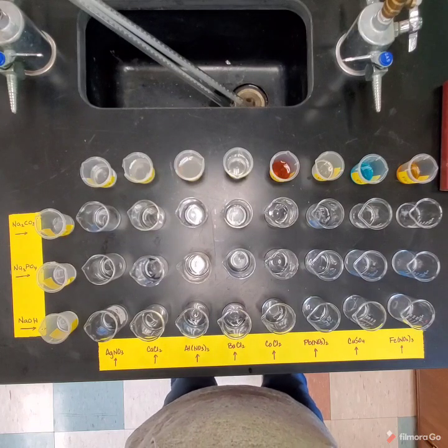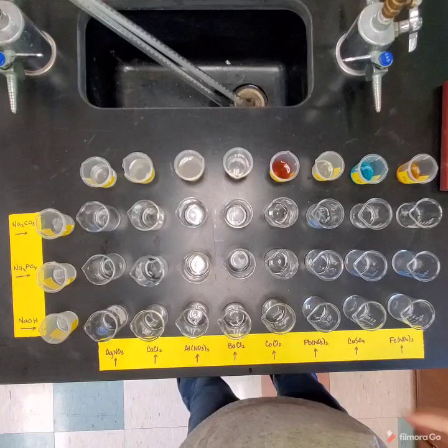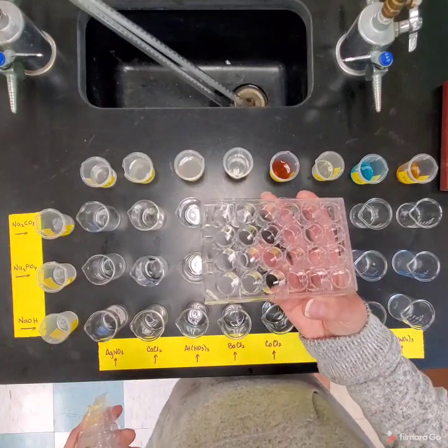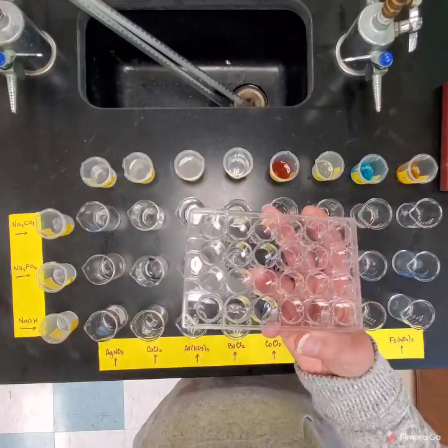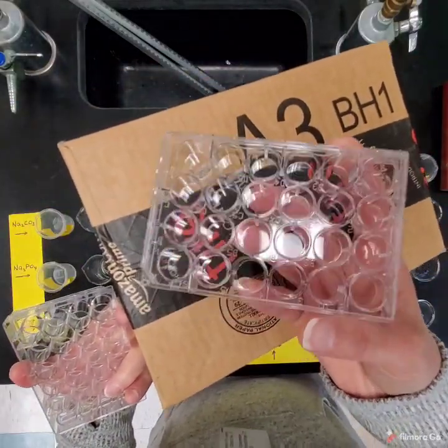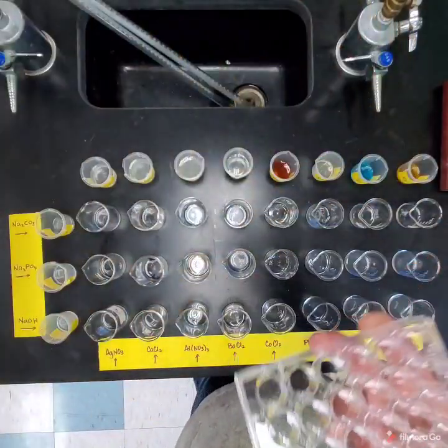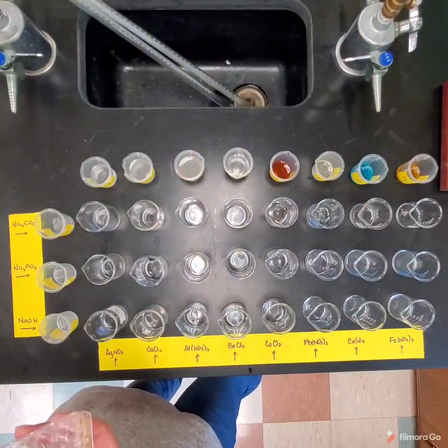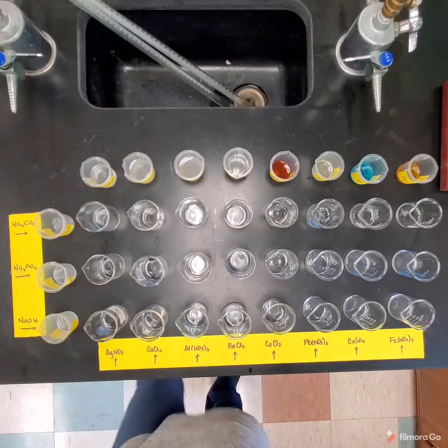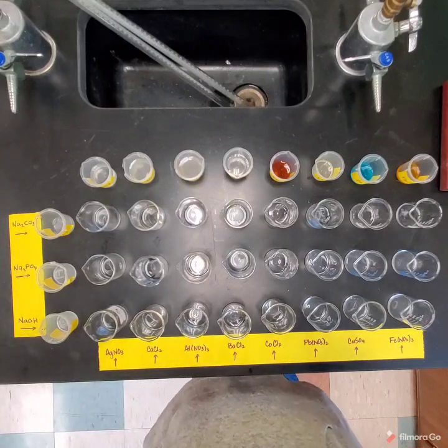Now, normally this would be carried out in a well plate if you were doing this in class. A well plate looks like this. It's kind of hard to see. Let me get a solid background. So it looks kind of like this, where we have all these little wells that we can carry out a very small scale reaction. I'm doing it on a bigger scale just so you can see it. But basically the idea is we're going to carry out a grid.